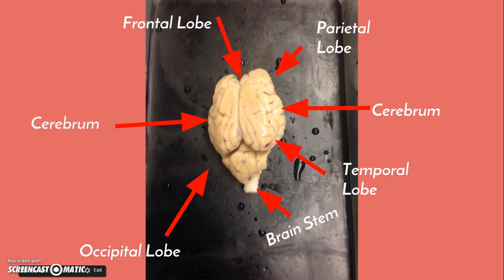Throughout the video, we will be labeling where these different brain parts are located along with their main function. We will start off with the frontal lobe. It is responsible for planning, decision-making, and problem-solving. It is extremely vulnerable to injuries due to being at the front of the cranium, and it is divided into two parts, at the left and right hemisphere.